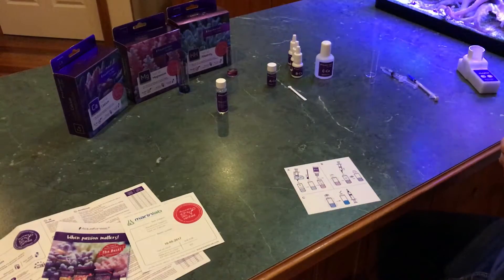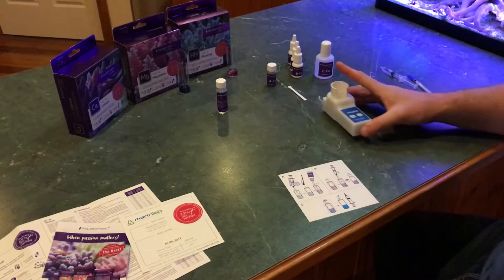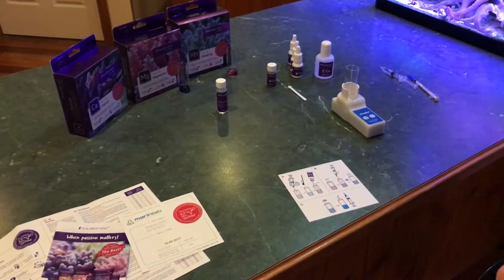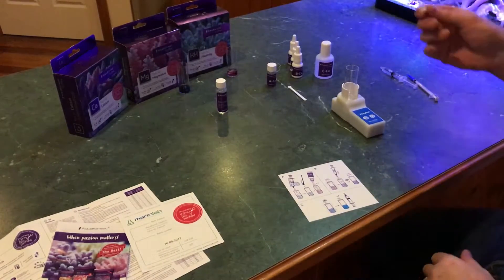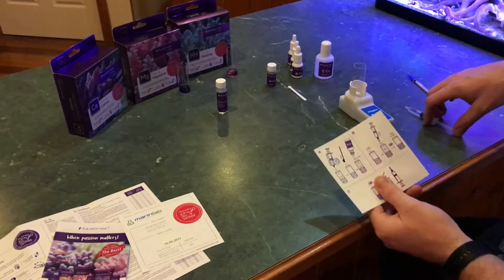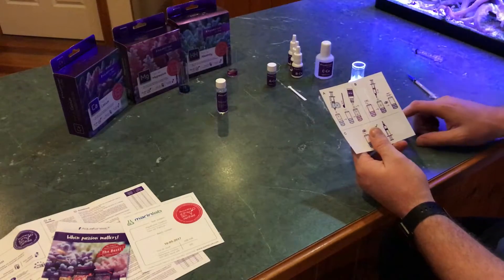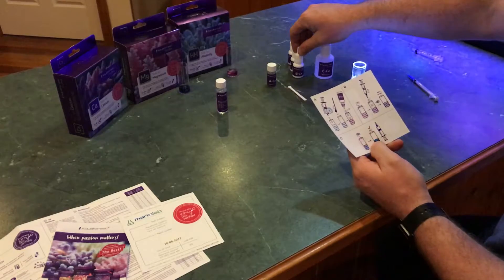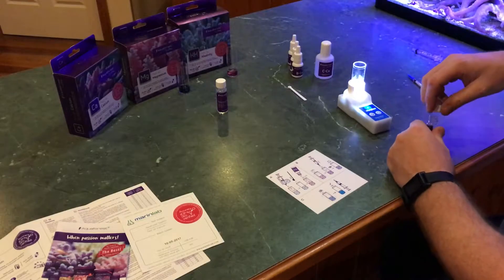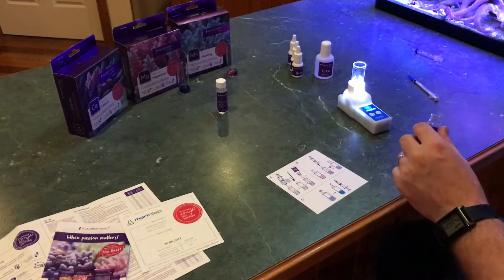That's going to last me too long at the rate I do testing, so maybe that'll give me some motivation to do more. Alright, I'll be using the speed stir again. Got my little stir bar for the speed stir — forgot that bit before. Step one: 2 mL of aquarium water in she goes. Put the speed stir on, grab one scoop of Reagent A — Reagent A goes before Reagent B. One scoop of that.